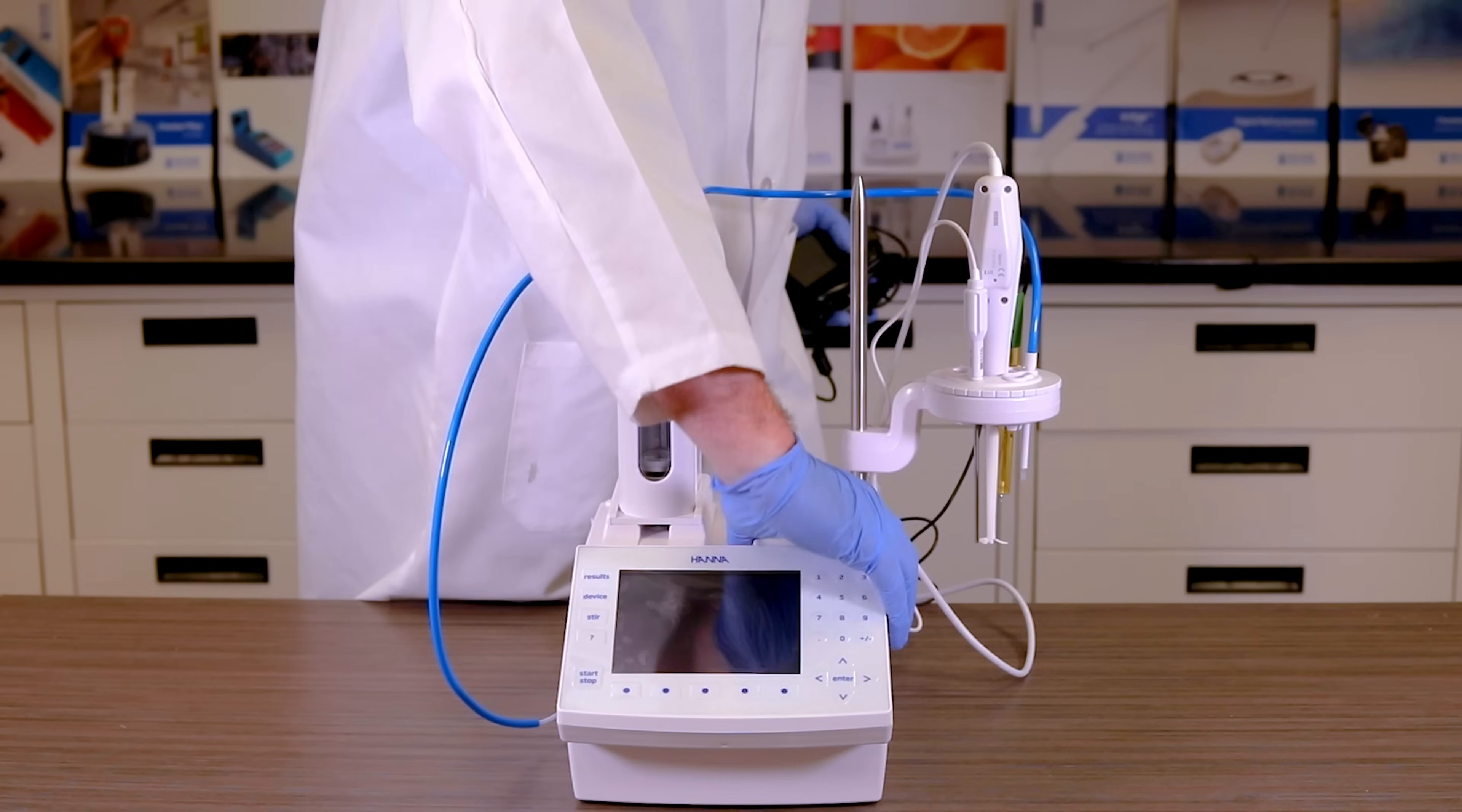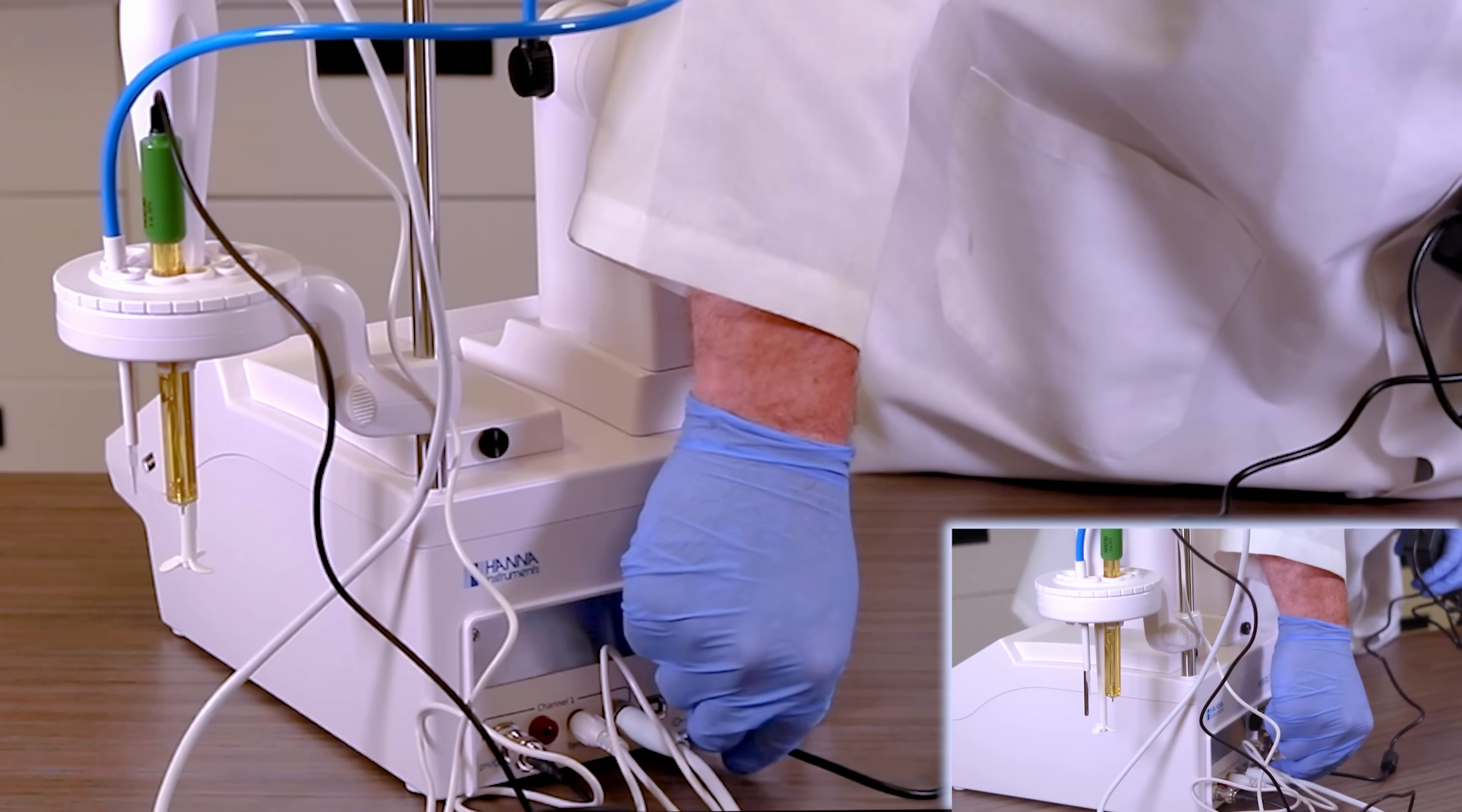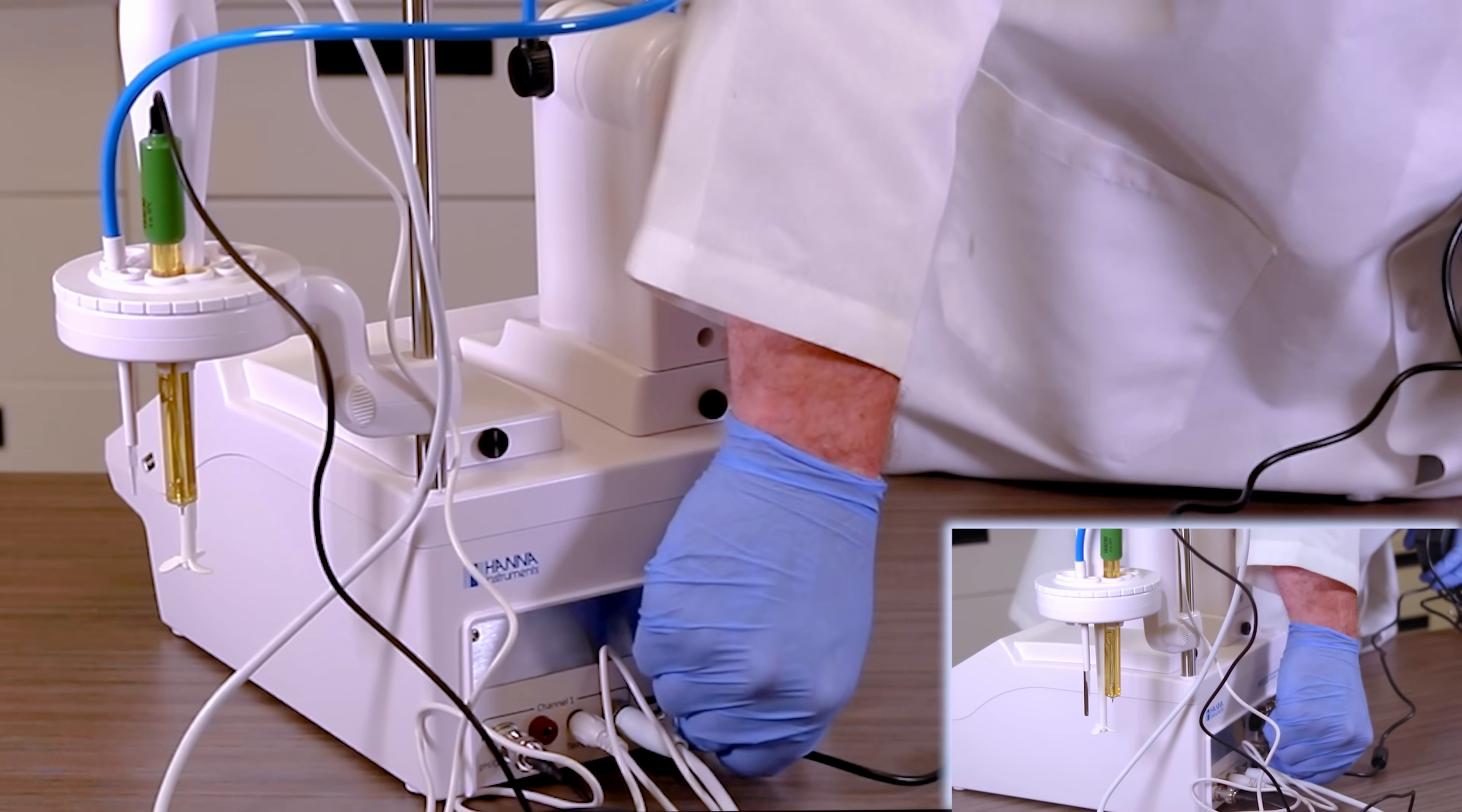Locate your power cord and adapter. Connect the power cord to the adapter and insert it into the power slot located on the back of the titrator.